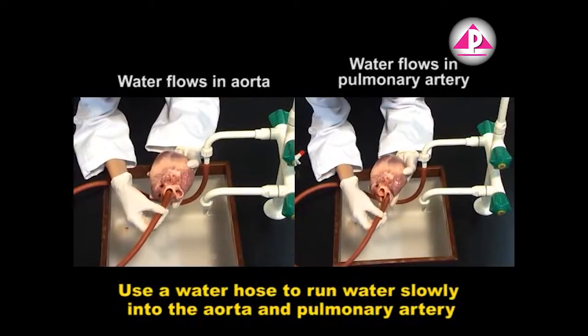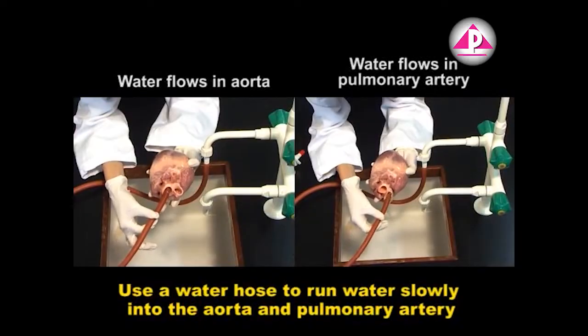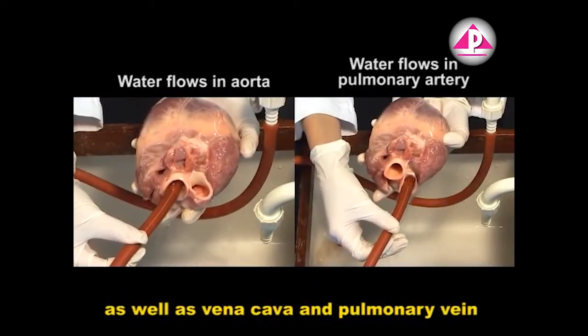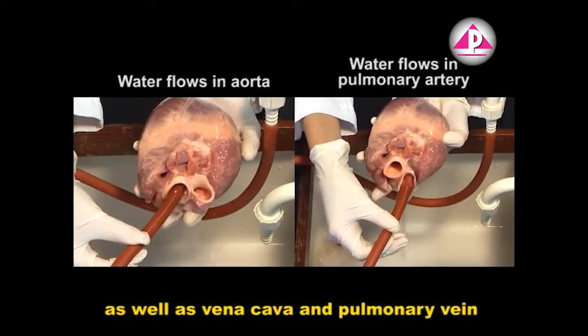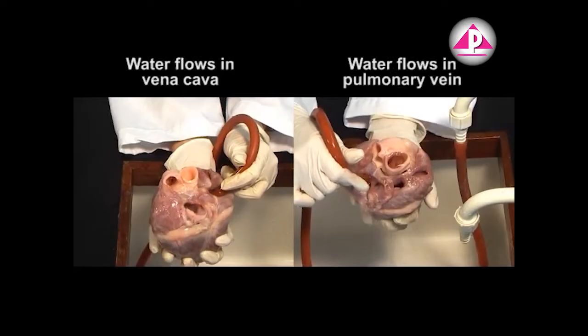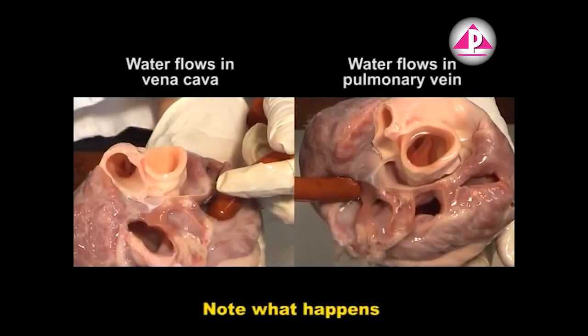Use a water hose to run water slowly into the aorta and pulmonary artery, as well as the vena cava and pulmonary vein. Note what happens.